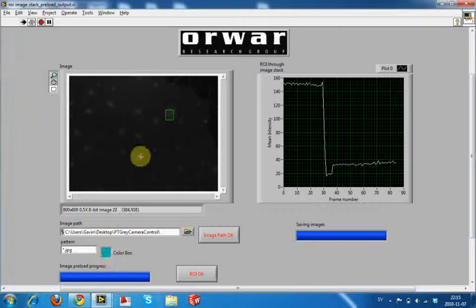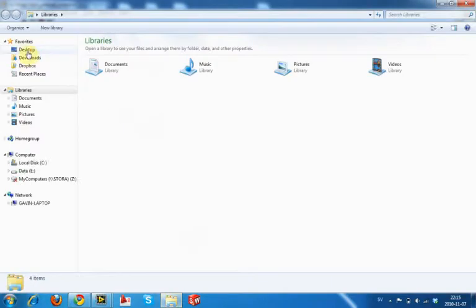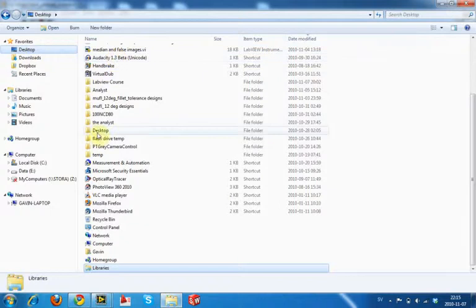All we have right here is a grayscale image, but this is just a representation. The actual image is red, as I shall show you here in the original file.